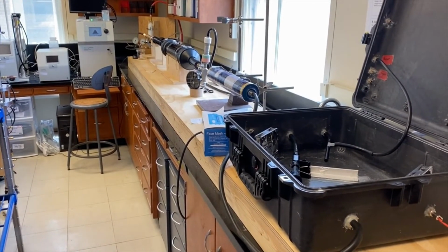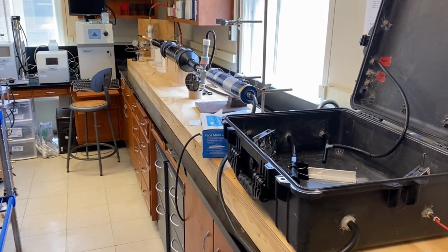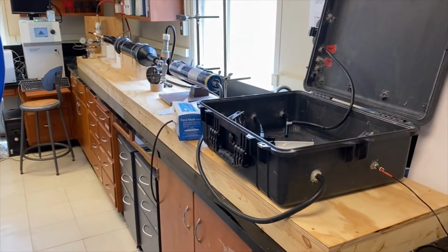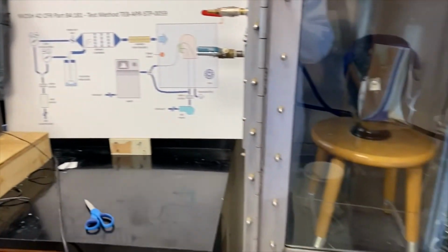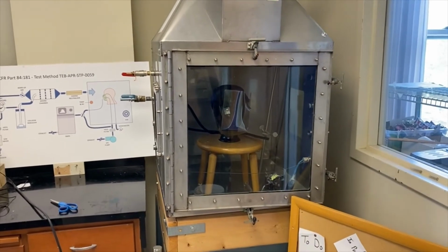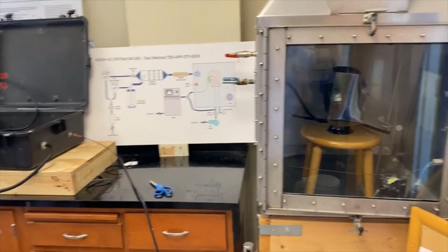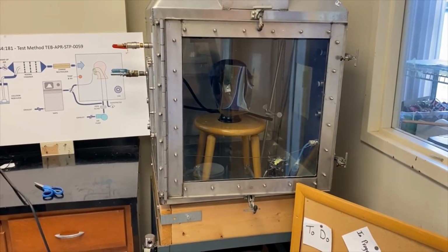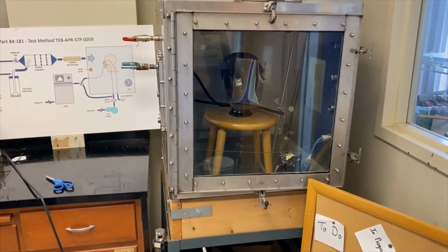But what about more sophisticated masks? Say those that have a silicone facepiece or that actually need to be attached to something that more closely resembles a head. Well, I showed you those mannequin heads at the beginning, and that's actually what we use those for. We have a large stainless steel chamber, and we can substitute that large stainless steel chamber for the Pelican case that I just showed you and use it to test different kinds of masks. So for instance, masks that are used for firefighters or other emergency responders that fit the full face, and so on.